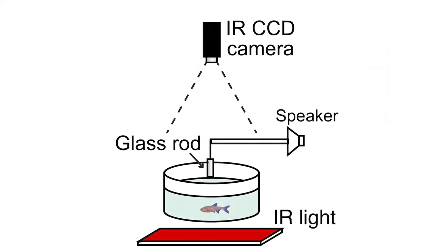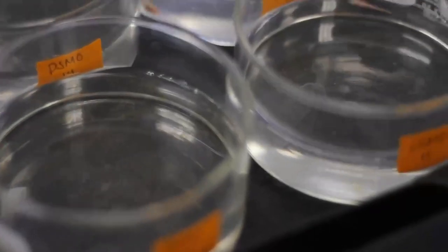To assay vibration attraction behavior, a vibrating glass rod is inserted into a glass bowl containing one fish in the dark. Fish are acclimated four days prior to the assay in conditioned water with a 12-12 light-dark cycle.